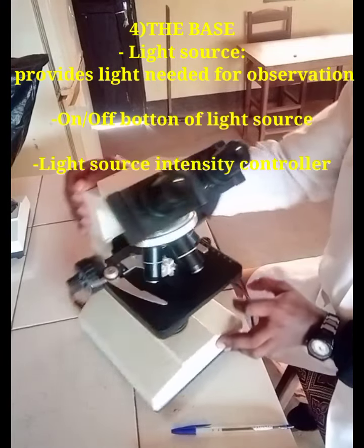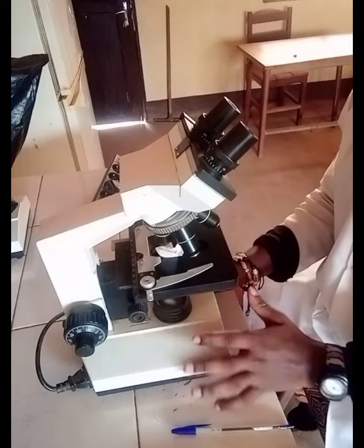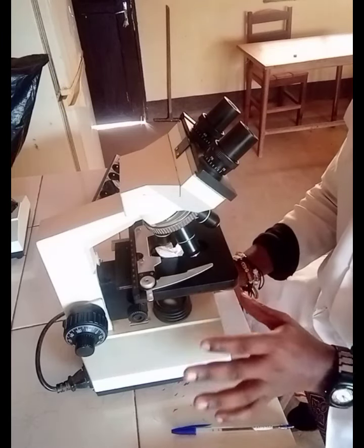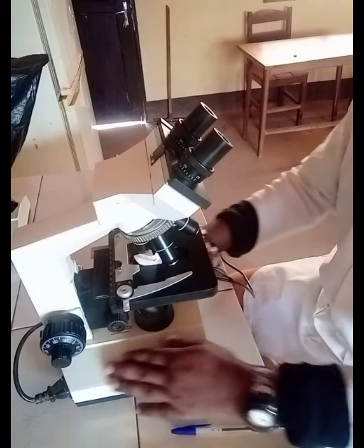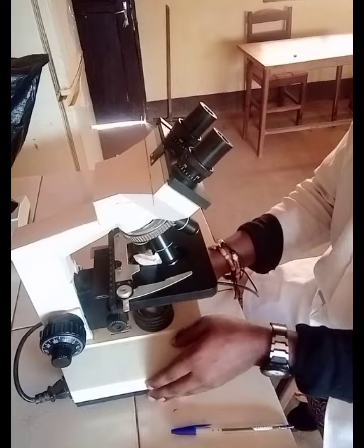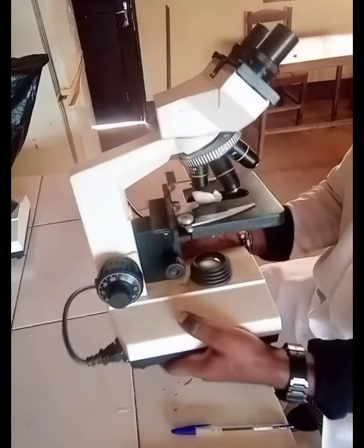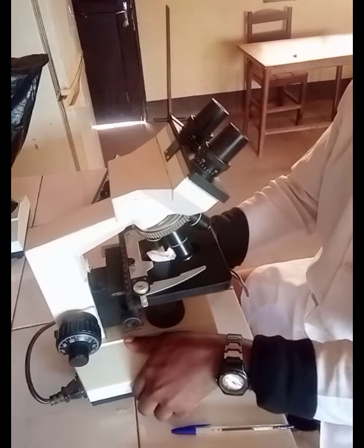Now, knowing all of that, those are the most essential parts of the microscope which we ought to know by heart. As I said, here is the base of the microscope. Now, how do we carry our microscope? We carry it from the base. This is how we hold our microscope. We hold a microscope from the base. Carry it from the base.